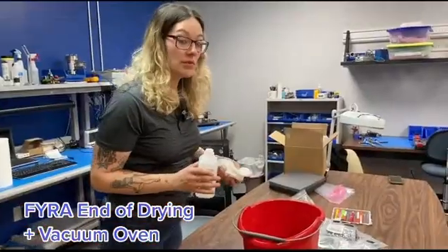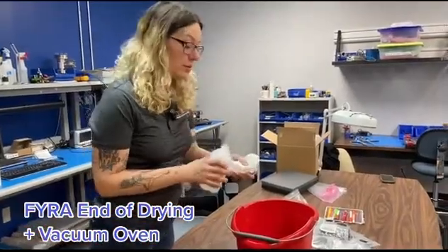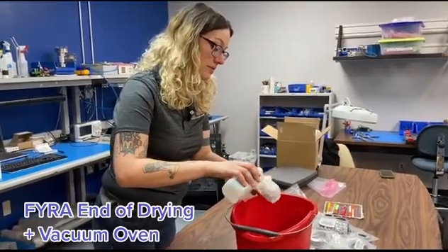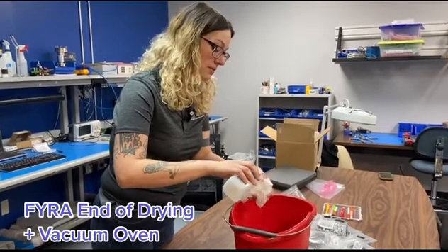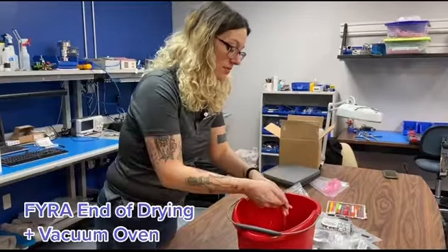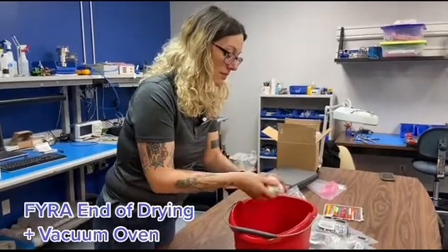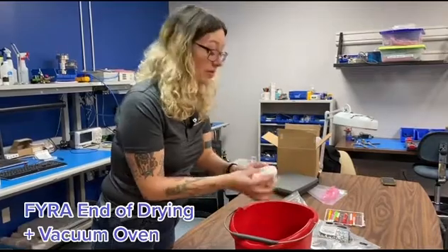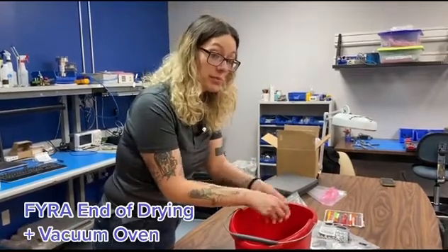Now we're going to soak this rag with isopropyl alcohol in order to approximate the heptane removed from the isolate. Now that the rag is wet, it'll go back in the oven so we can show the effects of too much moisture in the oven.